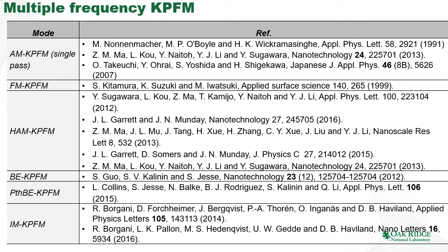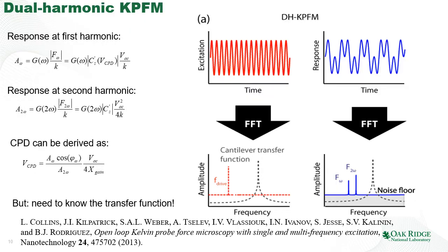But during this lecture, I'm going to talk about the logic behind the choice of specific techniques and how the different configuration of the KPFM setup allow us to measure some specific interactions. So let's start with the relatively simple example of the dual harmonic KPFM.